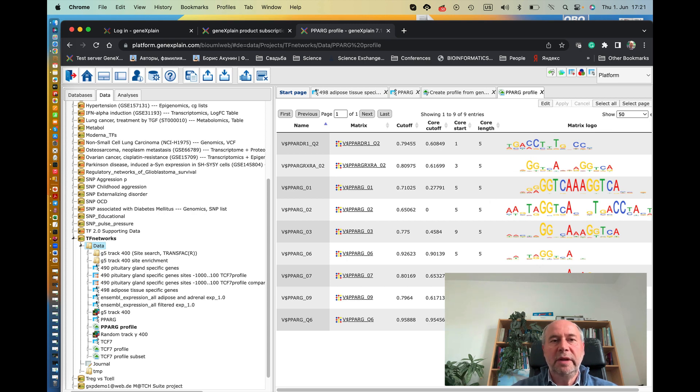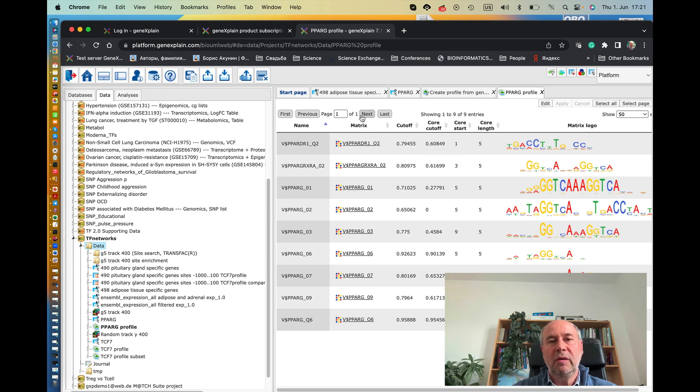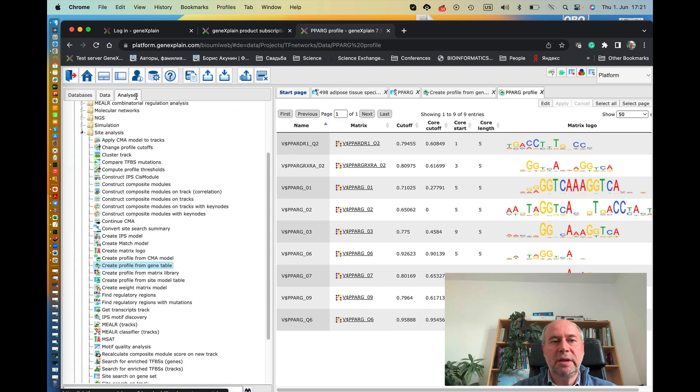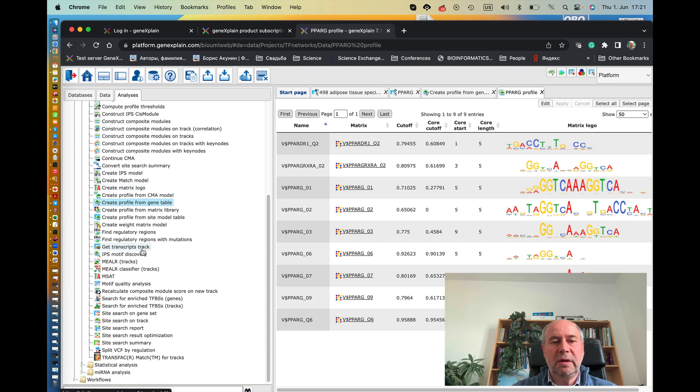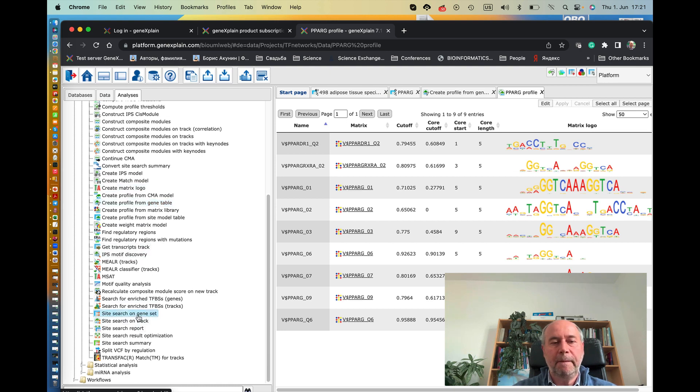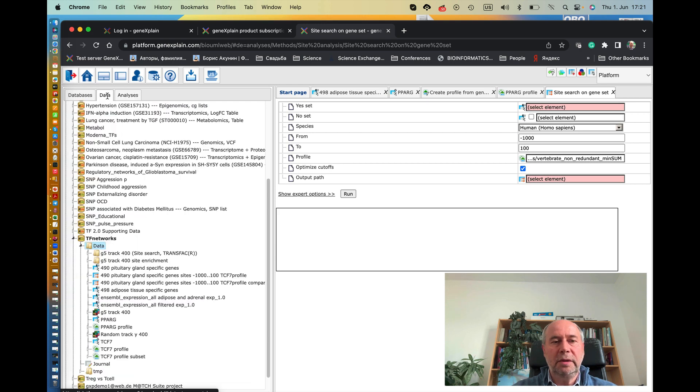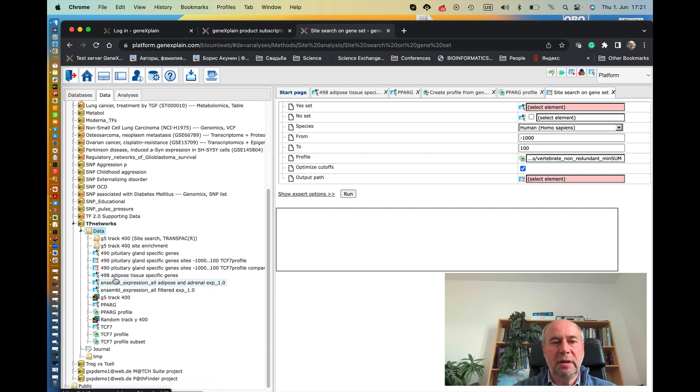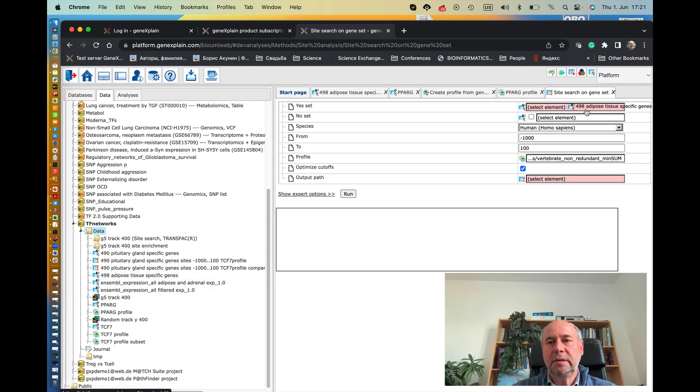So the next step is to take this profile and run it for site search in this gene set of 498 adipose tissue-specific genes. So to do that, we go to the analysis section again and start the program called site search on gene set. So now go back to the data and drag and drop here the gene set, which is 498 adipose genes. Drag and drop it here.